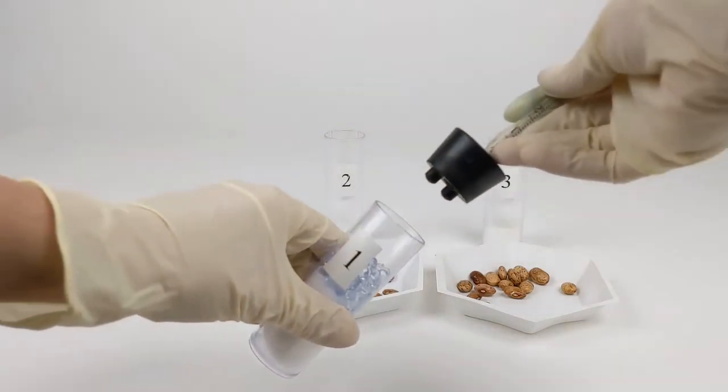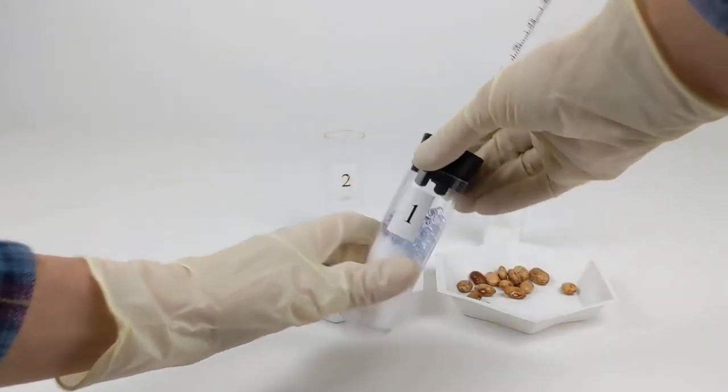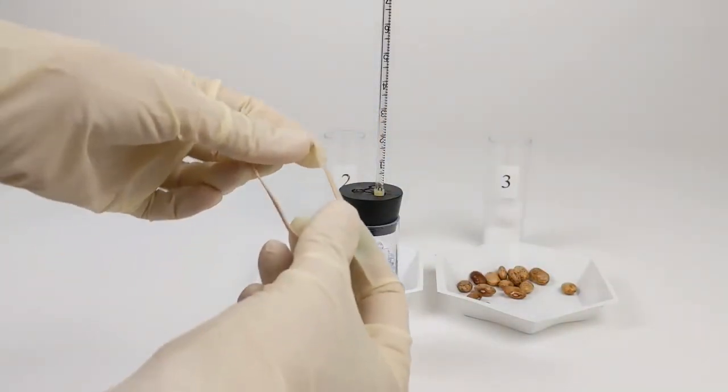Next we're going to put the pipette and stopper assembly on top of the vial. This is a rubber stopper that we're pressing down hard to make sure is in place.